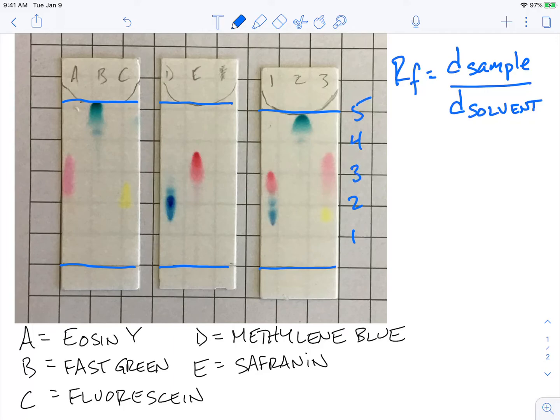So our solvent front is really close to about five centimeters for all of them. It is important to note that in the first two plates, the one on the left in the middle, it is a little bit higher. So you do want to calculate your RF values for each plate.